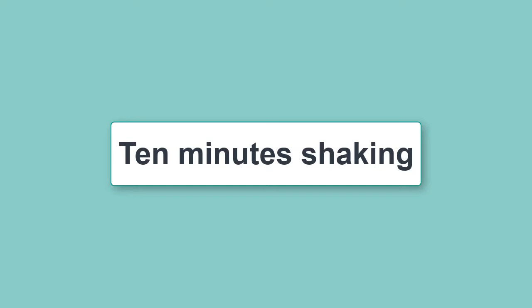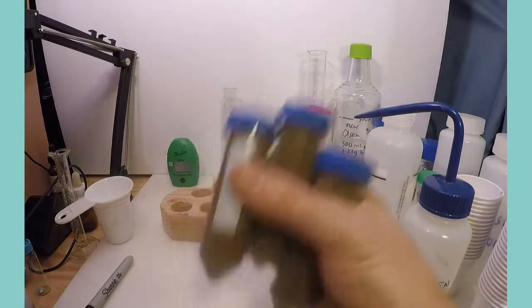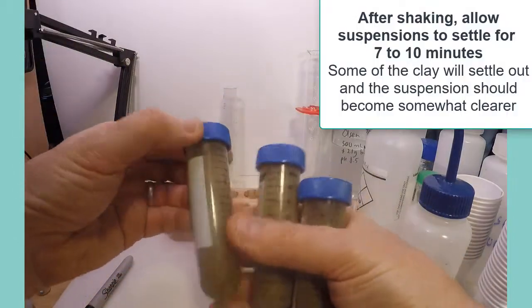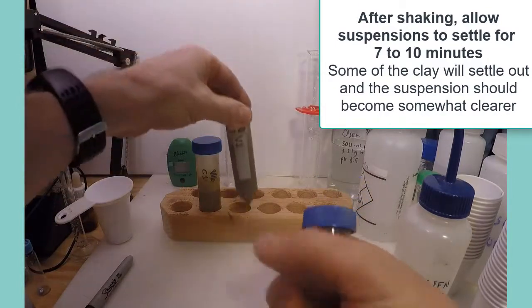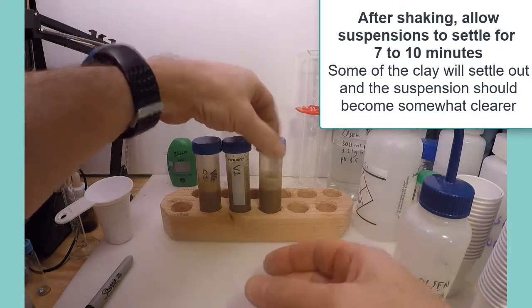The soil and Olsen solution are shaken for 10 minutes, then the soil suspension is allowed to settle for 7 to 10 minutes. This time should be long enough to allow efficient filtering in the next step.